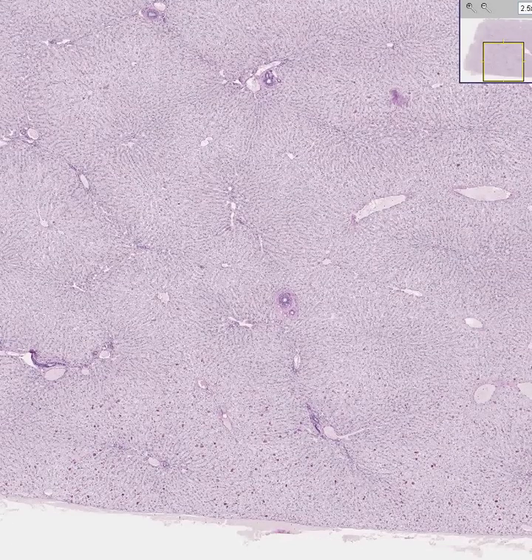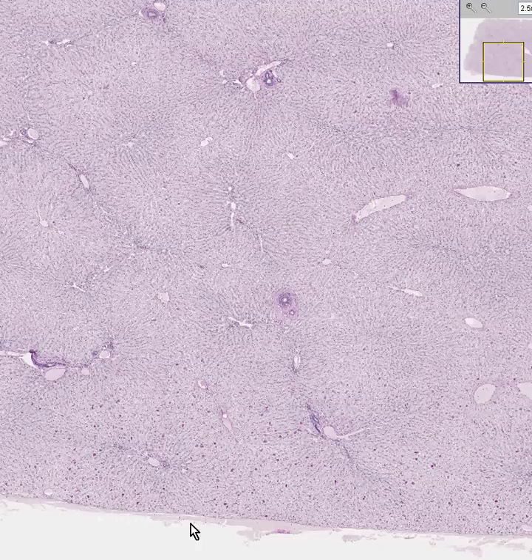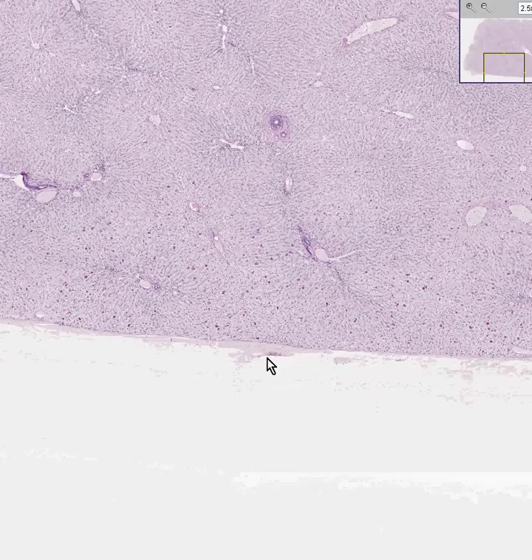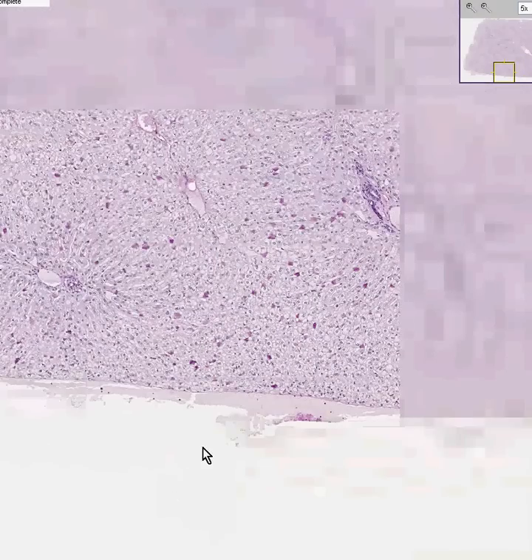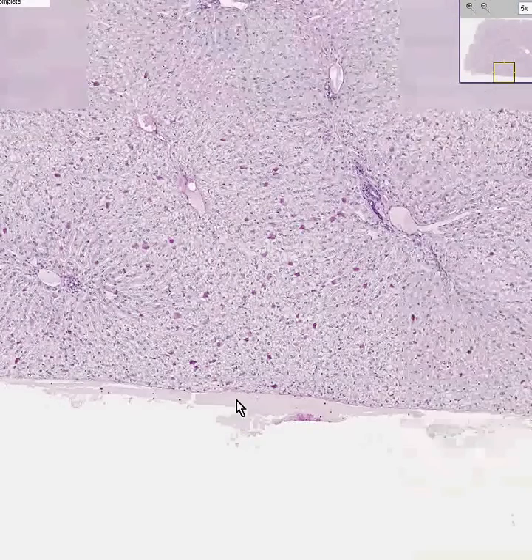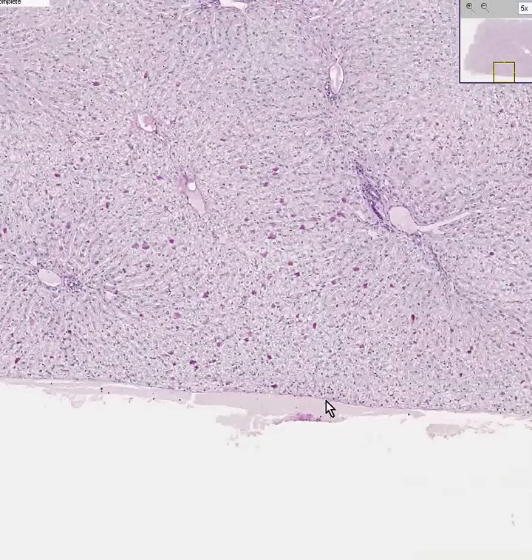This little bit of fibrous connective tissue at the edge is probably the true capsule of the liver. And like every capsule, it's mostly fibrous tissue.